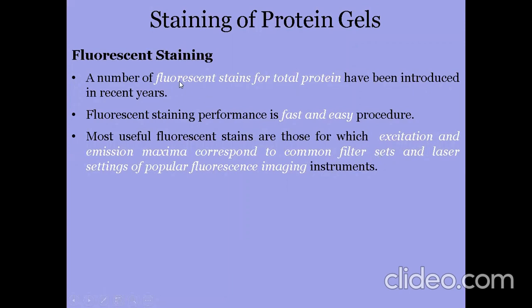If we use fluorescent stains but cannot detect them with our popular instruments, that will be difficult for us. So those fluorescent stains must be used for which we have common filters available through which we can detect the excitation. We need to excite the fluorescent compound if they are bound.